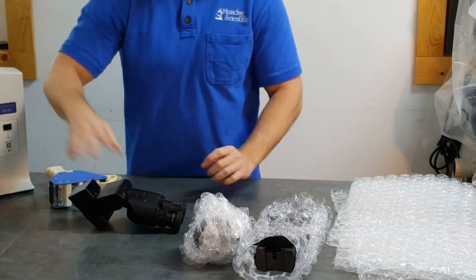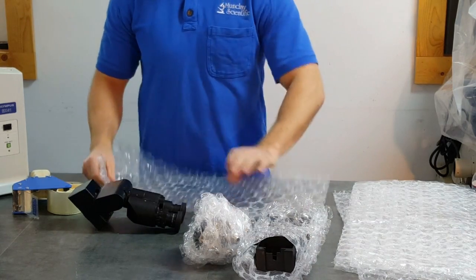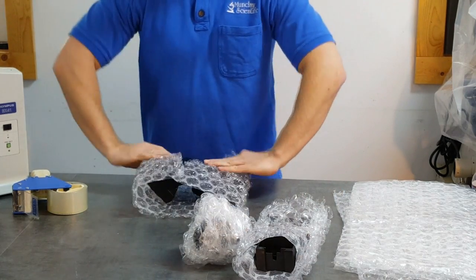Wrap the nosepiece with objectives and set it to the side. The head is a commonly broken item — we're going to wrap this and we'll double box it later. Set it to the side.